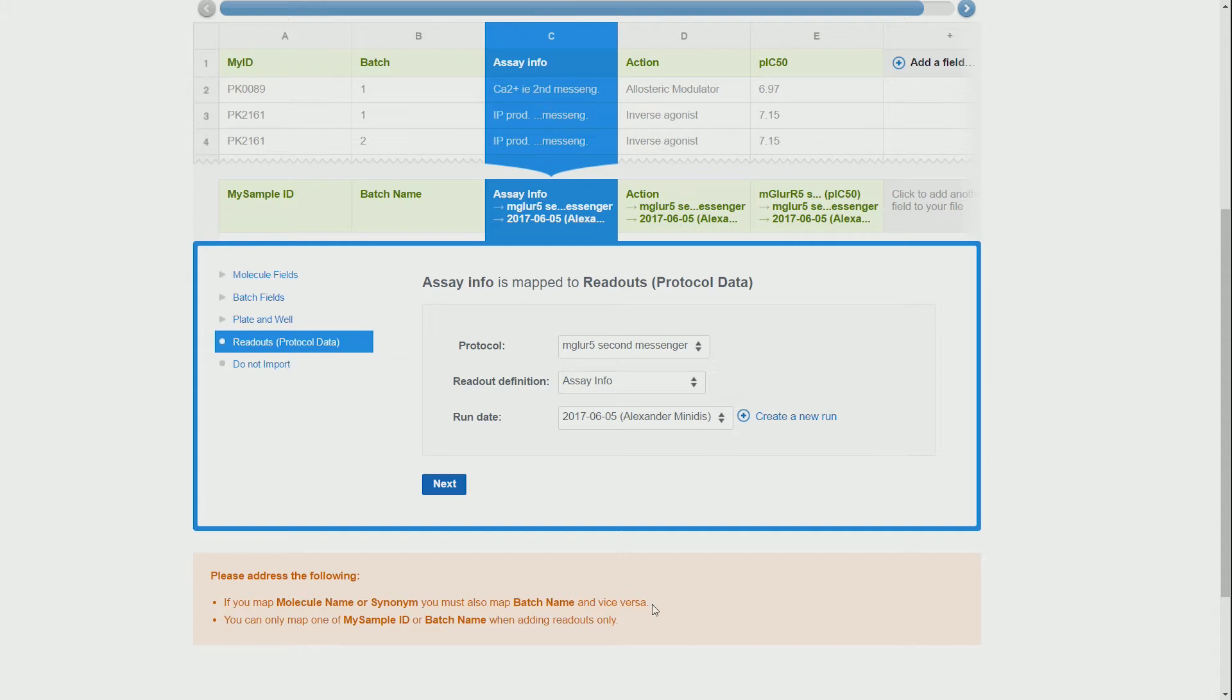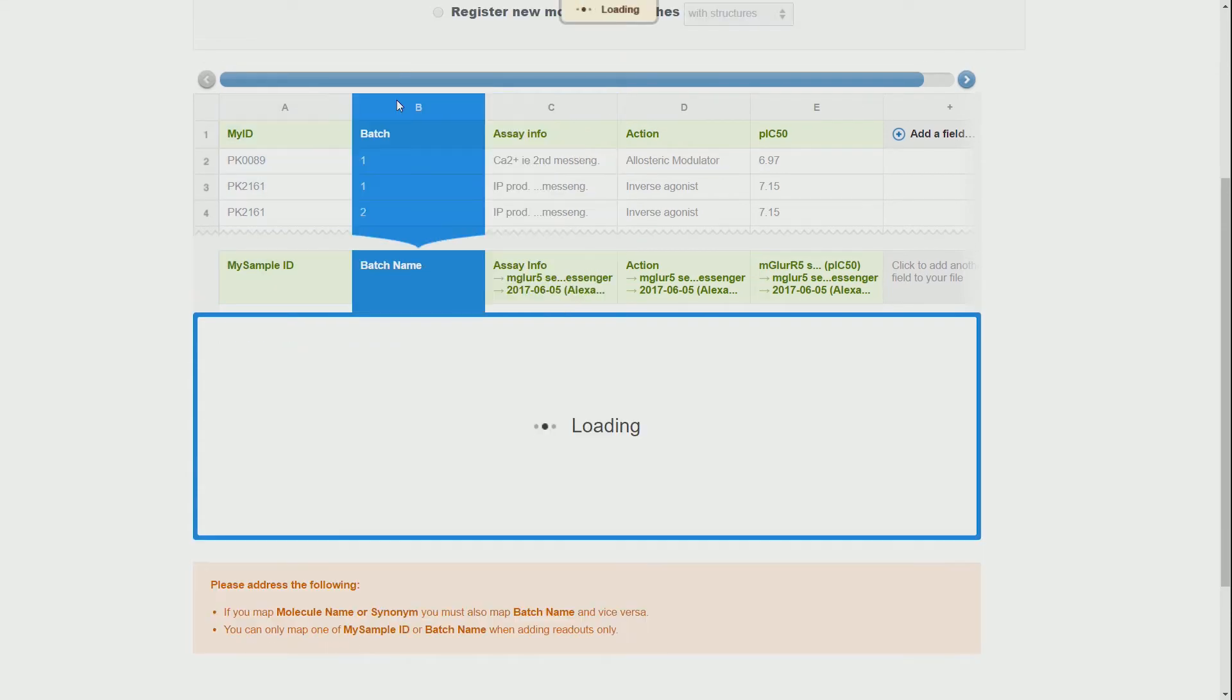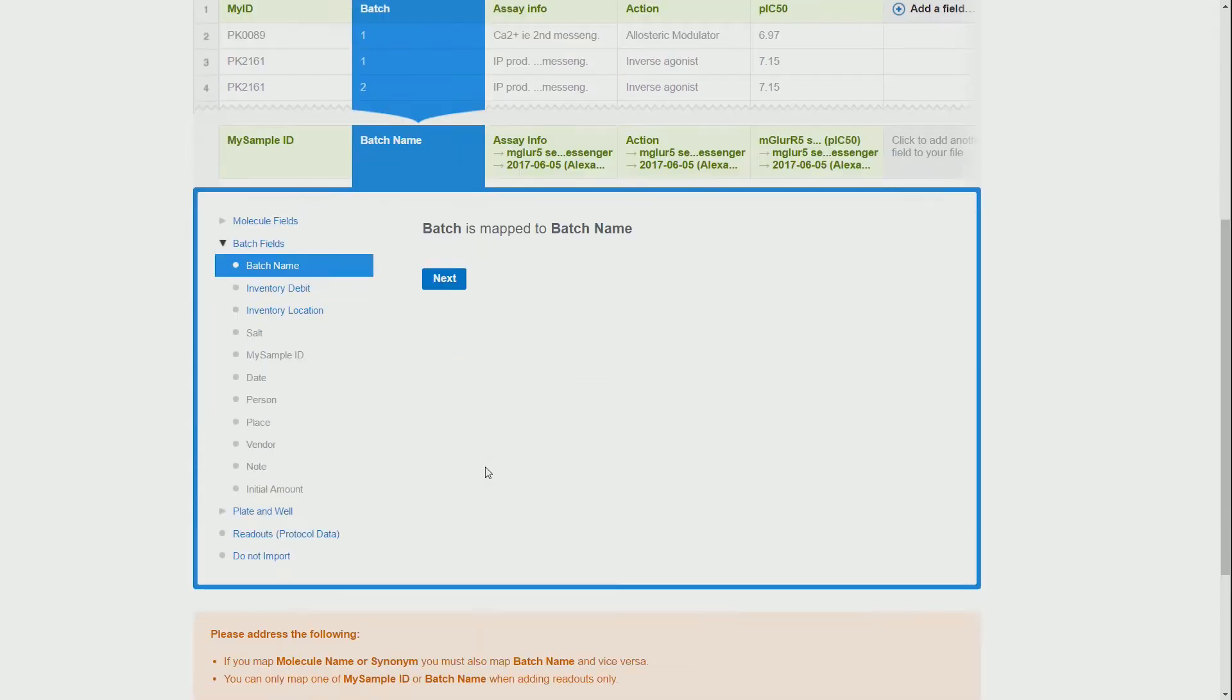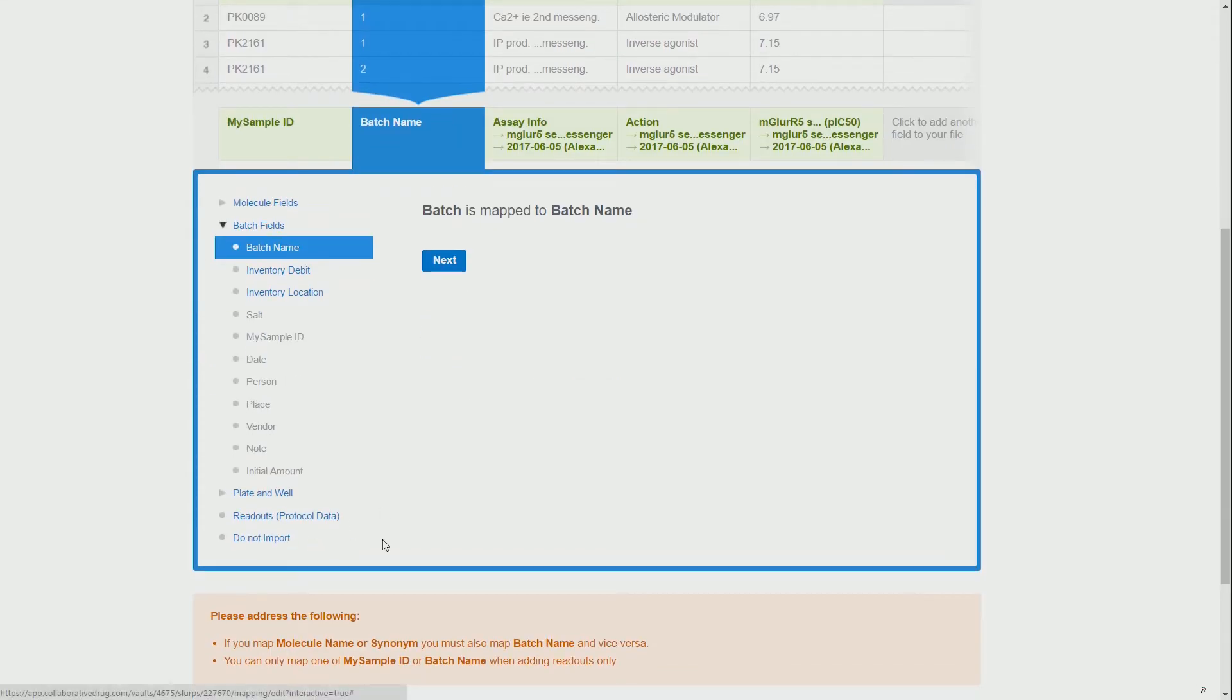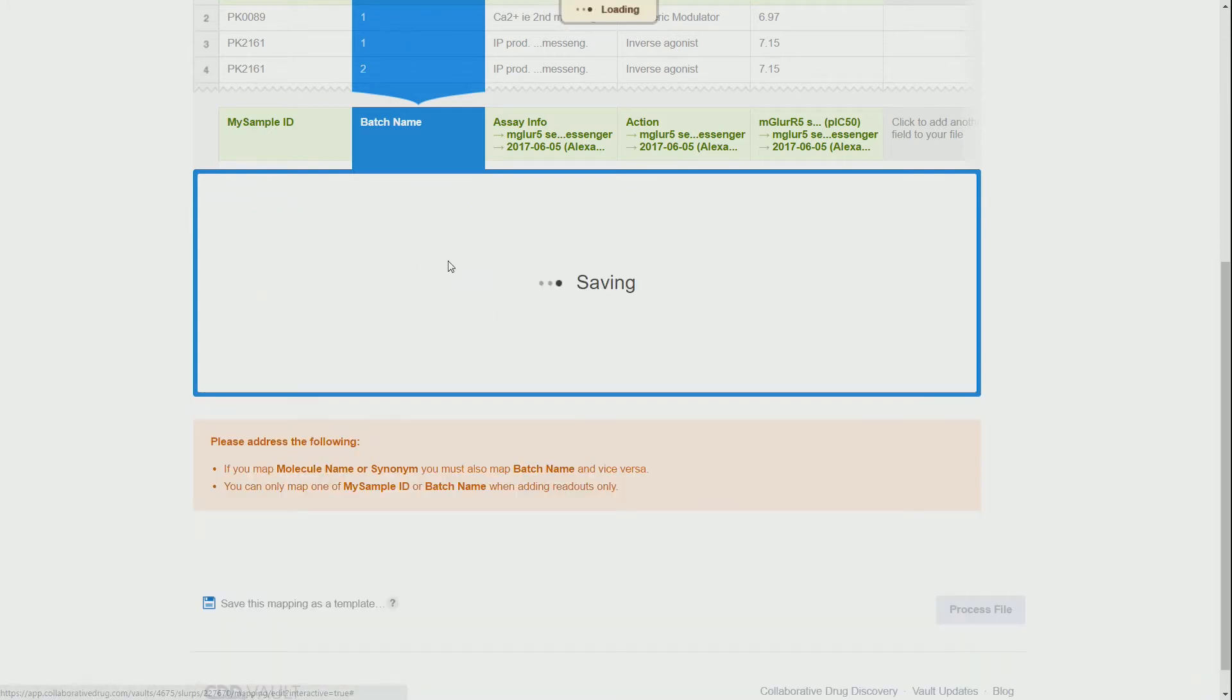And here will be our next problem, because it is easy to be lured into thinking that the batch here from our original structure import file will be the same batch as CDD has assigned.